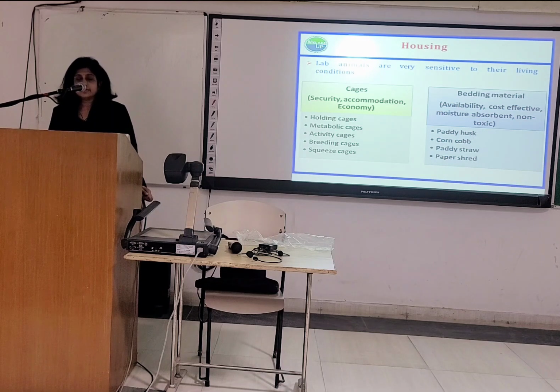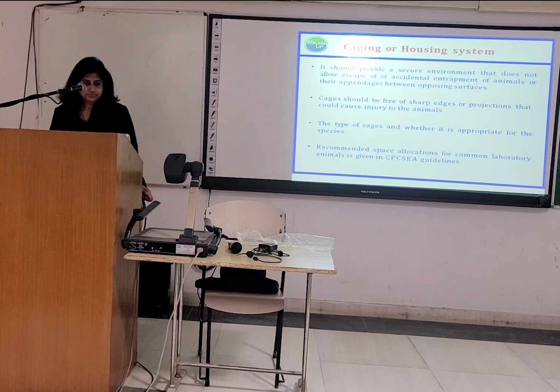Then bedding material should be easily available. It should be cost effective, moisture absorbent, and non-toxic. There are different types of bedding materials like paddy husk, corn cob, paddy straw, paper shred.